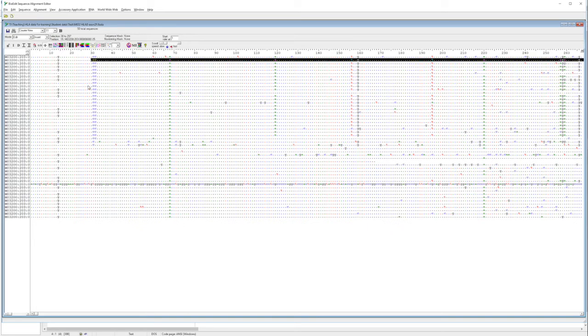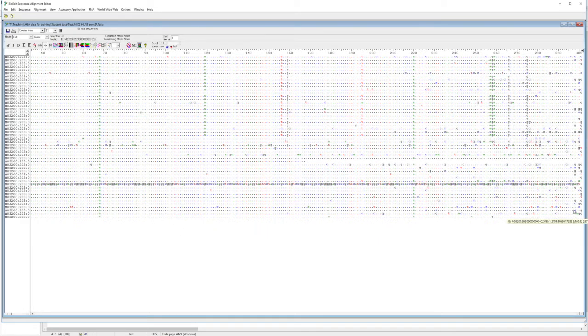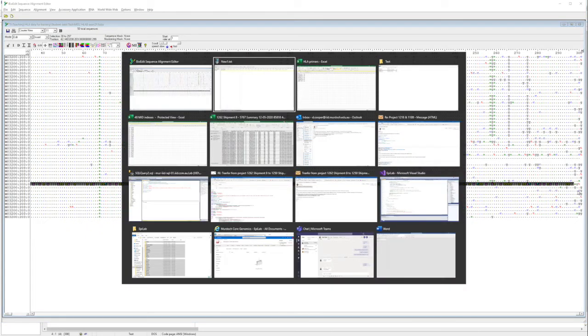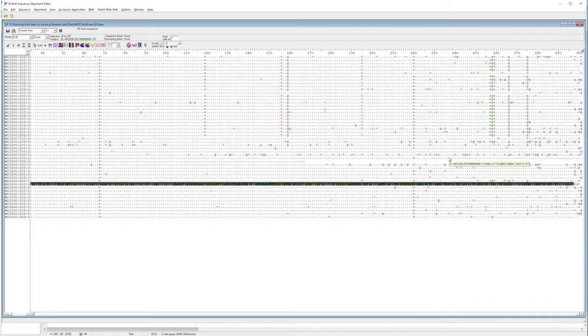So what I'll do is, remember we start our consensus sequences in this position here. I'll just click there and hold down the Shift key, and again we just want to end. This one's a little bit shorter, so it's 3 bases from the end. Copy that. Go across to the PS pad and paste that in. Go back. Now we need to fix up those errors.